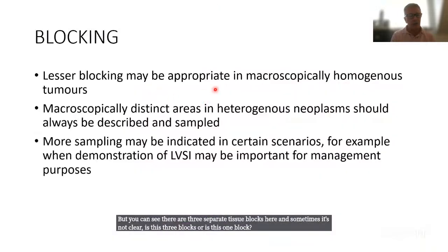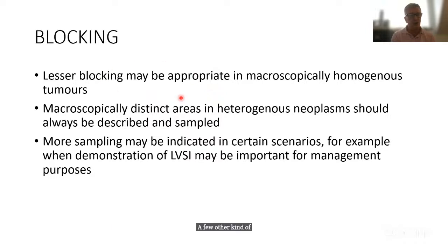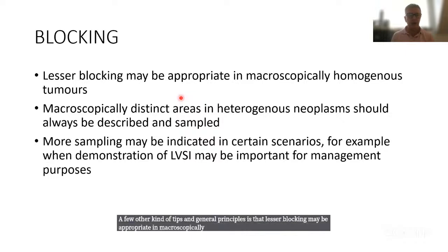A few other tips and general principles is that lesser blocking may be appropriate in macroscopically homogeneous tumors, whereas in tumors with macroscopically distinct and different areas, heterogeneous neoplasms, the different areas should always be described and the different areas should be sampled.